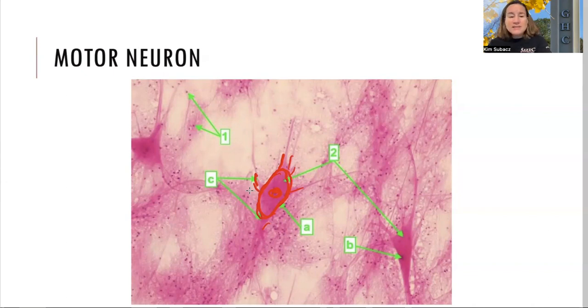And those best friend cells are called neuroglial cells. So that's these little guys over here. All of these are the besties of the neurons. So all these little smaller things, you can make out these little nuclei, they look like speckles all around the edges. Those are all the best friends. Those are all the neuroglial cells that support your neurons of your central nervous system and your peripheral nervous system.